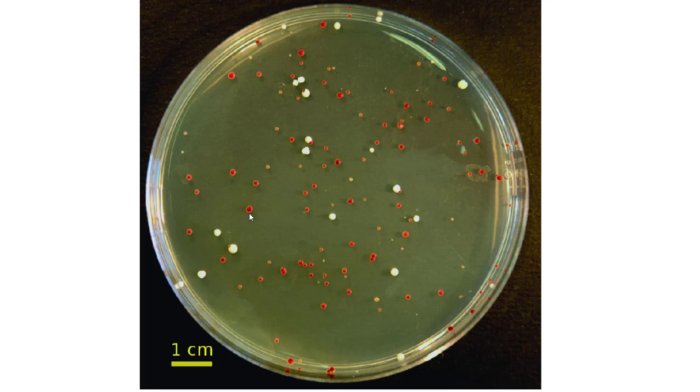And so I'm going to give you some data simulating how many red cells and how many white cells we would have gotten more or less from previous semesters' experience.